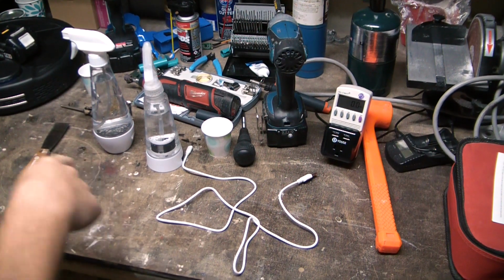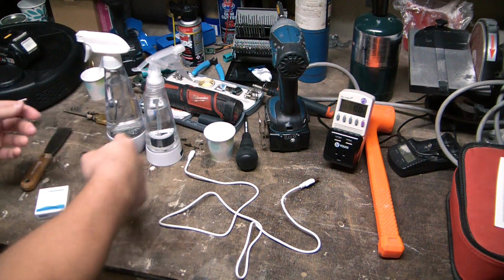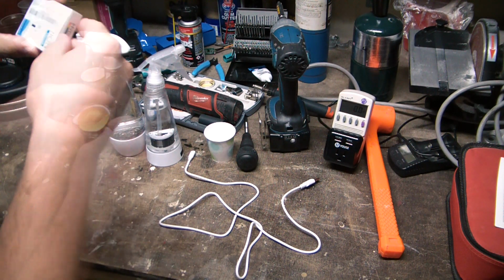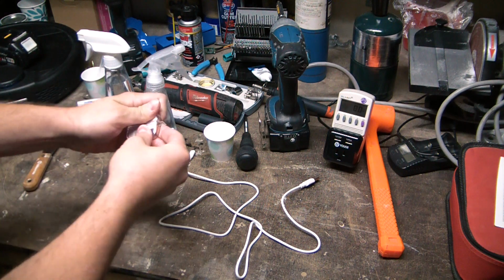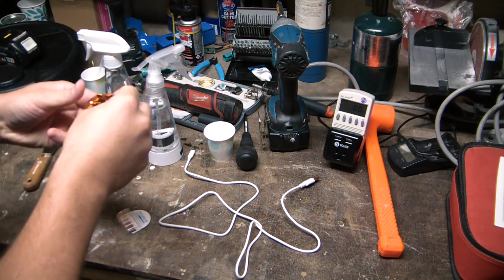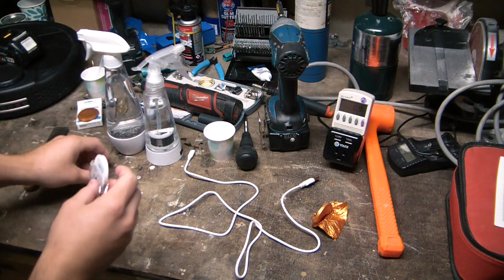So it's been a few days. I didn't want to start tearing these down until we actually saw what they produced. Gave them a couple rinses in DI water, and this is all fresh DI water, so there's no skew in here. I got a chlorine test kit. Good company, Hydrion. I use these guys for pretty much all my pH strips. Kind of probably the gold standard, at least for pH strips. Curious to see how these chlorine ones work.